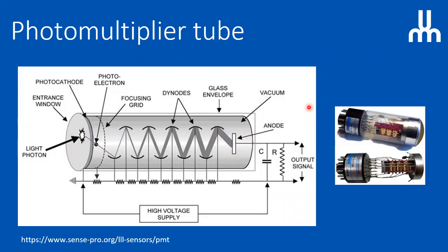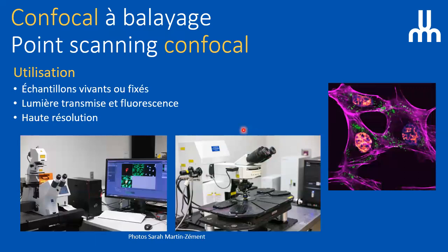The downside part is that here, the efficiency between the photon and the electron is not as good as cameras. So the best of this can be 60 or 50% efficiency. So you get 2 photons, but you can measure only 1. So you lose a lot of light, but you can do this in microseconds. What does it look like, and why can you use it?